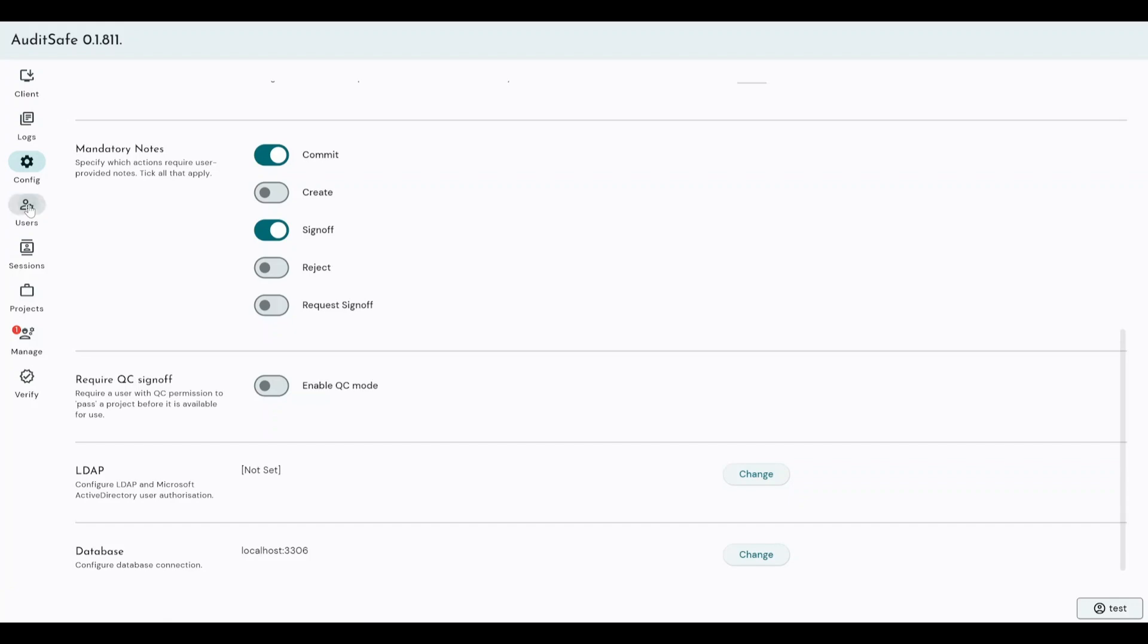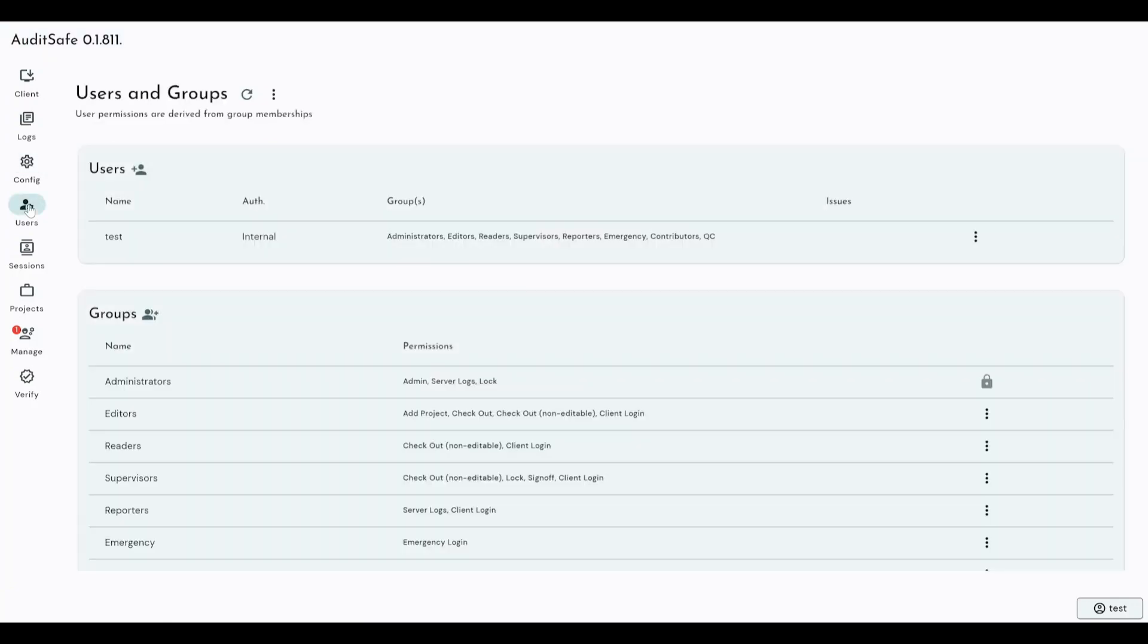Speaking of which, here is where you would create your users. So users, we have two different sections here. We have users and we have groups.